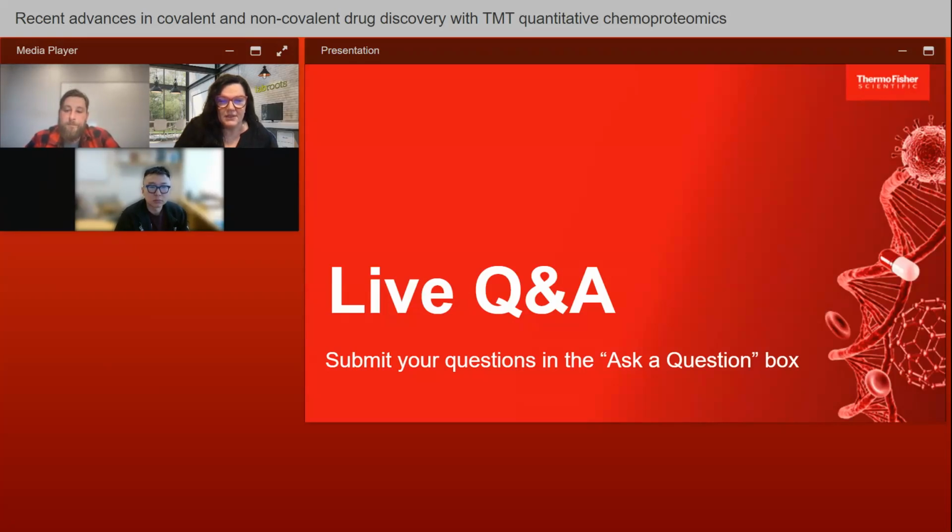All right, fantastic. And the second part to that question: have you tried to follow up with spatial proteomic experiments or protein-protein interaction studies? Yes, we tried a few approaches to follow up on these sets of studies. Basically, what we do with the thermostability changes is we detect the events of the initial binding, and then we can also see the immediate reactions within the cells, like the signaling propagation.